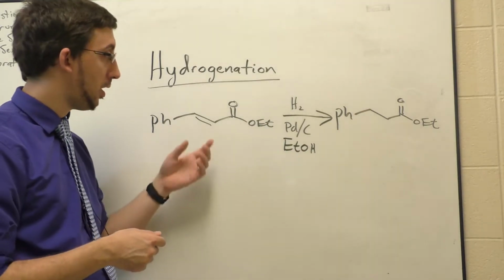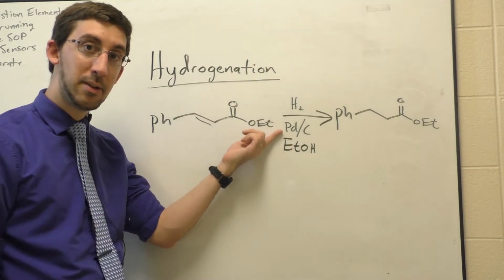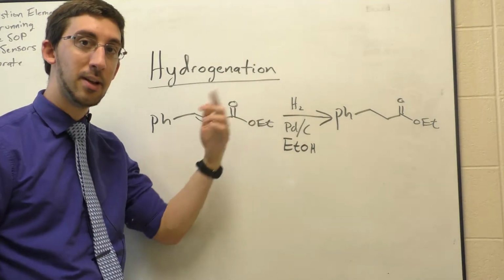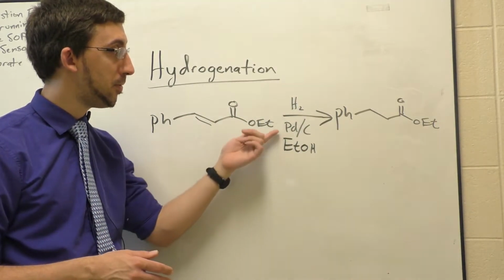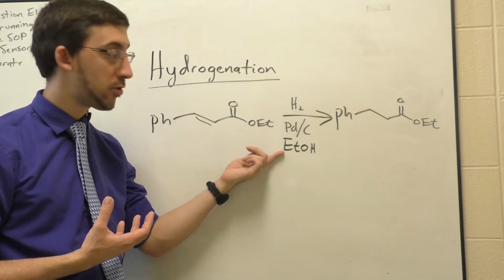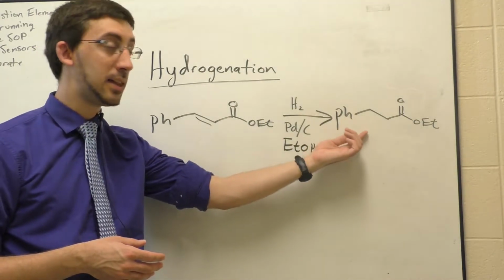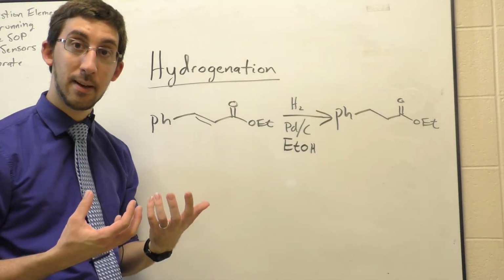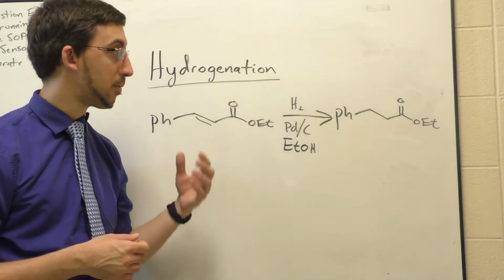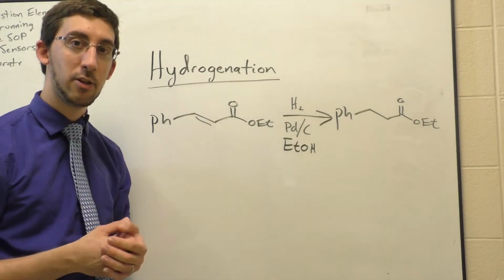So all we'll do is weigh out or measure out our starting material, our substrate, add our solid black palladium on carbon, add our solvent, put a balloon of hydrogen over the reaction, and let it run for about an hour or so. Then all we have to do is filter to remove the insoluble palladium on carbon. We'll use a rotary evaporator to remove the solvent, as I'll explain in lab. And then we should be left with simply a clear oil, which we can take a final mass of and take to the NMR room for final purity analysis. So with that brief introduction to what we're doing, let's head up to lab and set up this very interesting and simple hydrogenation experiment.